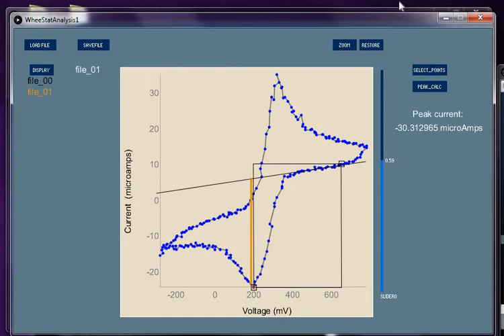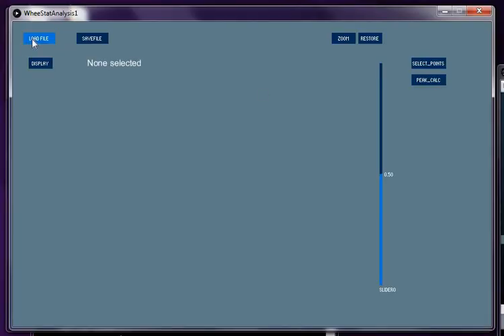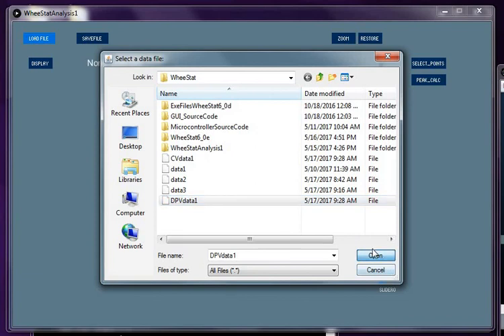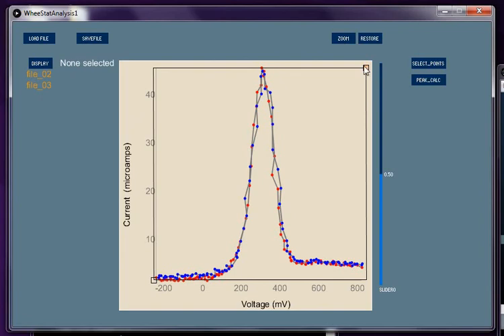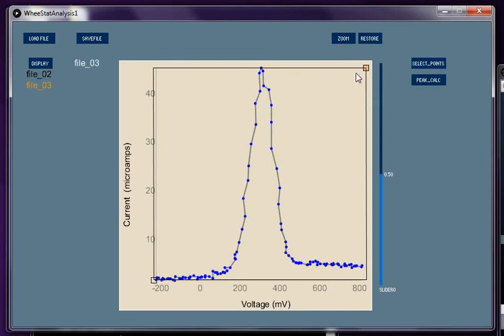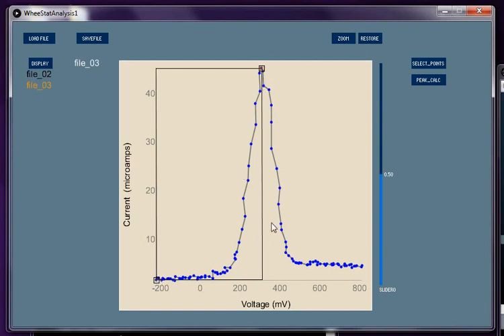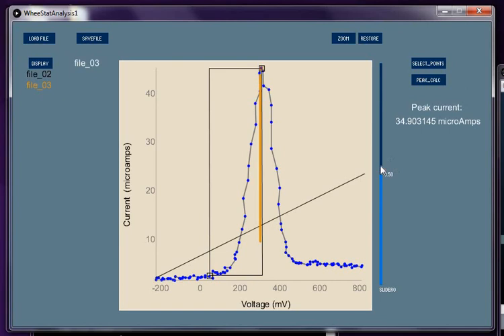That's for our cyclic voltammograms. Let's close that, we will restart the experiment and we will load now the differential pulse data. Open that up and once again we have two things. If we hit the peak calculations without selecting any points you'll see a little error message. Let's pick voltammogram 3 and we will pick that as our peak, select those points, do the calculation and once again we move the slider to give us the baseline that we want and this looks like 42 microamps.